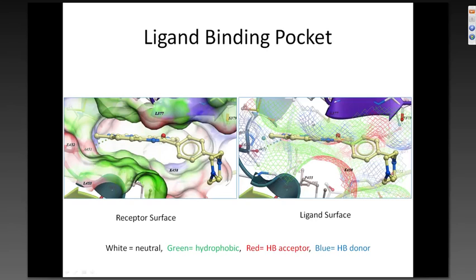Another way of representing the pocket, which gives a better way of seeing cavities where you may want to build out, when you can see dead ends quite easily, is called a ligand surface. It's a combination between the receptor surface and the surface of the ligand, a sort of subtraction of those two. And we'll see that example here.